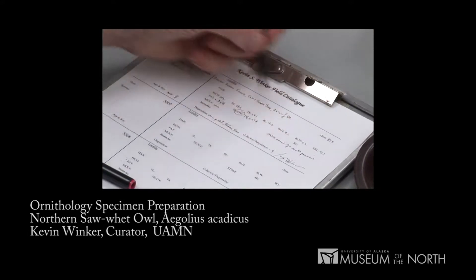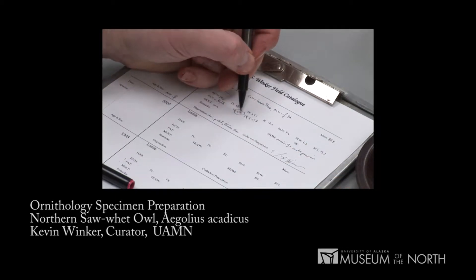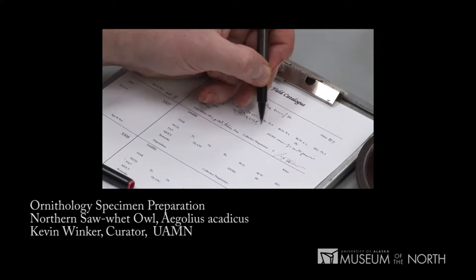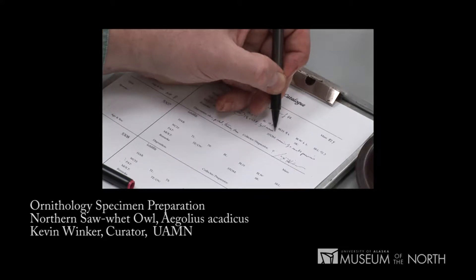I've left blanks for each of the measurements. I don't have any information on habitat. The fat that I wrote down right after preparing it was that it was very light — as you'll recall, we saw very little fat when I fleshed the skin. The ovary: I circled the gonad that we found and wrote down its dimensions. The largest ovum was perhaps one millimeter — they were pretty small.